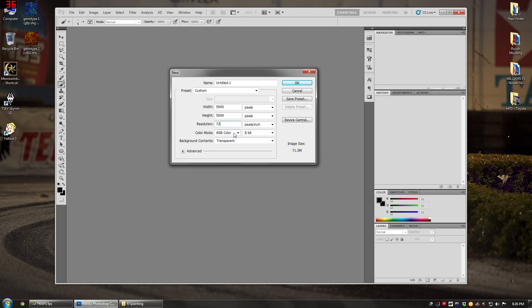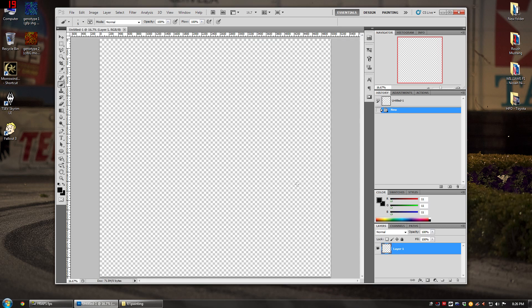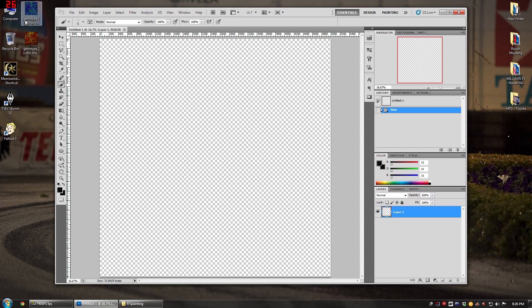Make sure your color mode is set to RGB, not CMYK or grayscale. RGB is the color mode you want to use, just like when you take your images. Once that's set, create your new canvas.